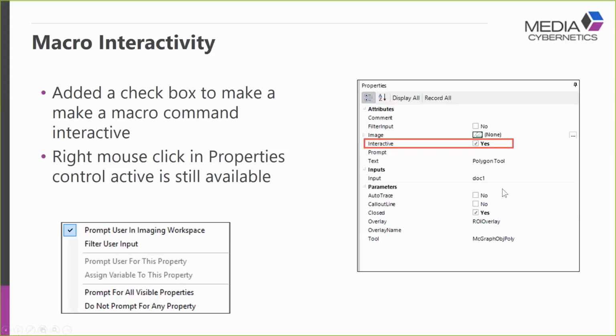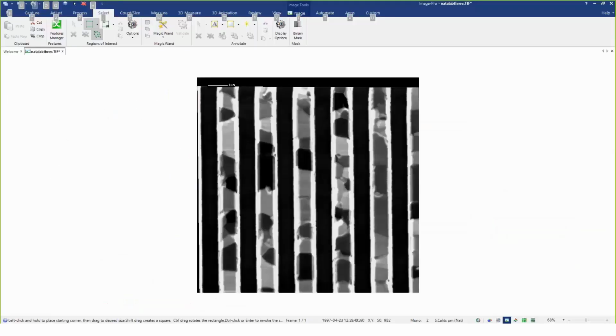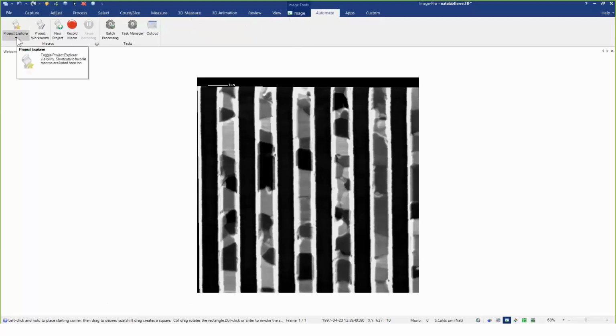I just did a simple macro that really is only about 3 lines, and you'll see in a second that it does nothing more than just go ahead and record this macro again. A macro, you can link it up to the quick access toolbar. You just simply go count this image.